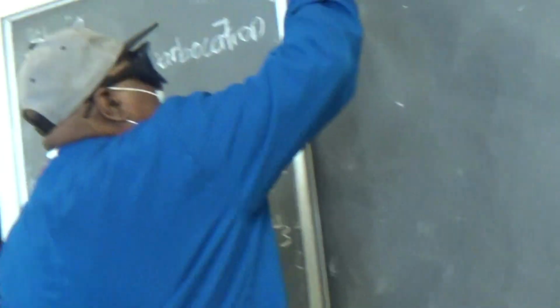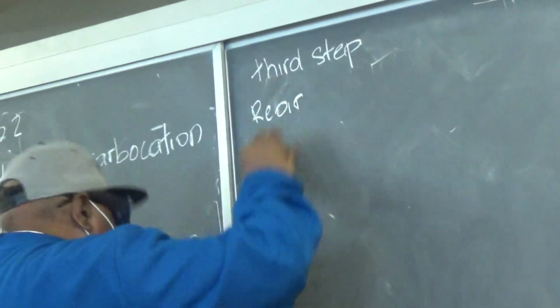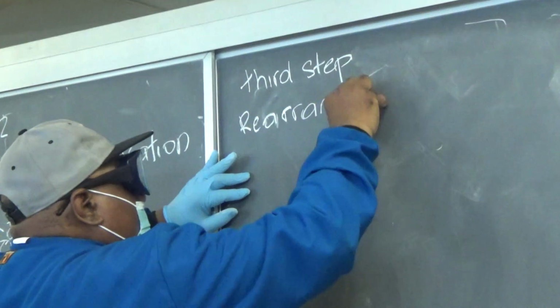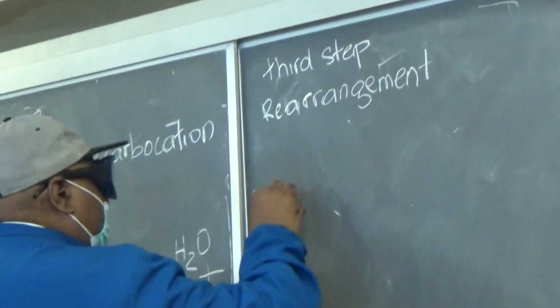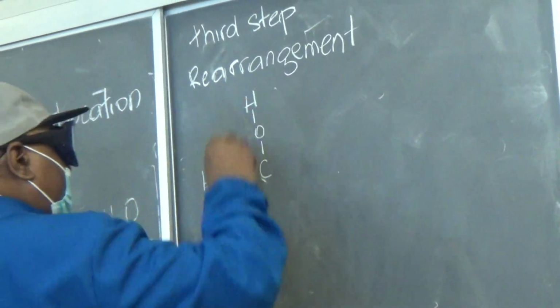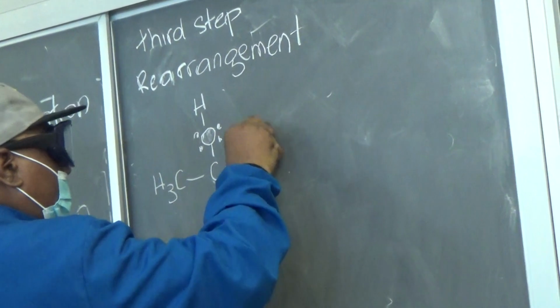Step 3. Rearrangement. At least in our current organic lecture, they haven't done this yet, but they will do it soon, I think the chapter after next. This is a really cool thing that carbocations do. So, I will do that again here. This time I will do that like that.